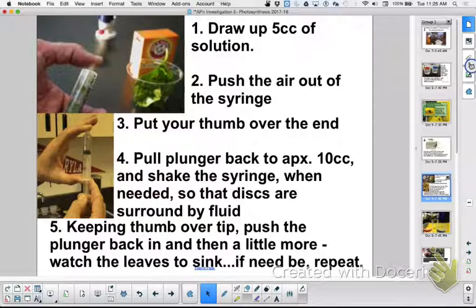Tell me, because you have to let them go a really long time to get one of those to float. And you want to max out at 20 minutes, okay? And just go through and then record it every 2 minutes. When you're done, you're going to clean and dry everything and put it away, except this stop box right here, okay? You can leave it at the station for now, because some people might want to come in at lunch, or they might want to repeat the lab or go again.